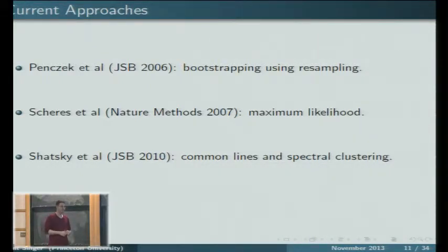These 100,000 images are from one shot of the X-ray? So you get several micrographs. In a micrograph, you have, say, hundreds of particles. You have to collect many micrographs. So you do resampling, and every time you reconstruct a new volume. So now you get different volumes, because every time you resampled different images. And now you do PCA for the 3D volumes that you get. Do what? Principal component analysis. What is it called again? Principal component analysis. Yeah. Okay, PCA.